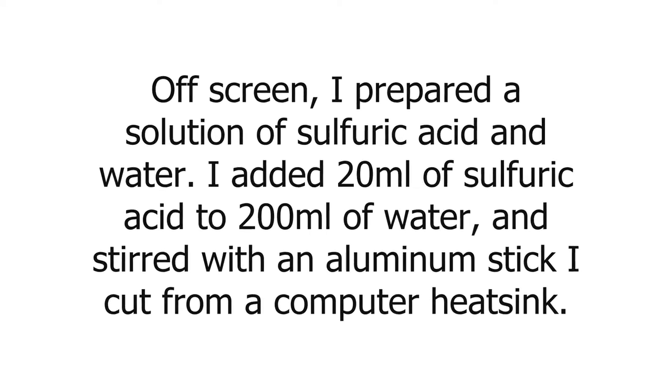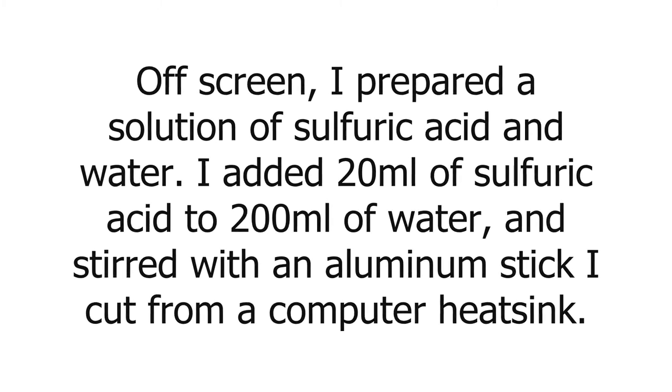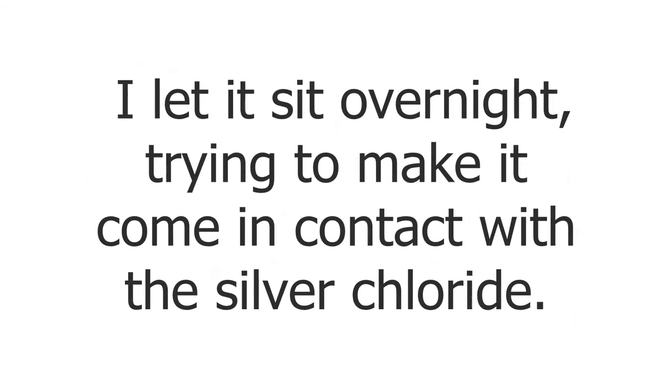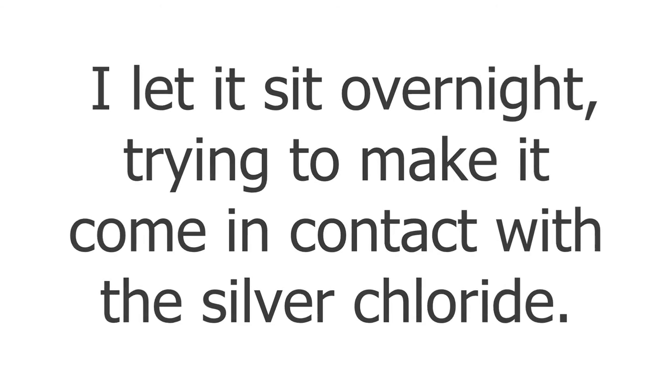Off screen, I prepared a solution of sulfuric acid and water. I added 20 milliliters of sulfuric acid to 200 milliliters of water and stirred with an aluminum stick I cut from a computer heatsink. I let it sit overnight, trying to make it come in contact with the silver chloride.